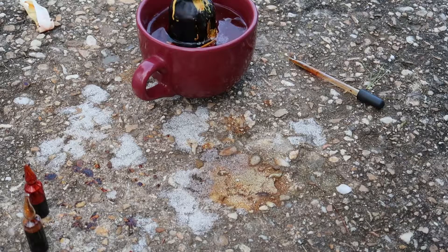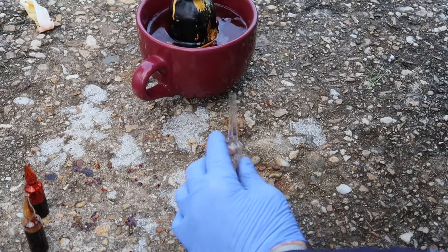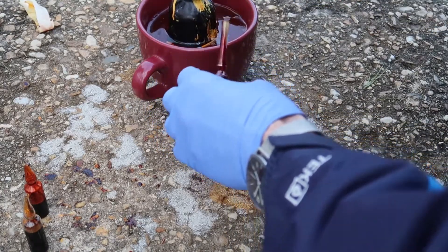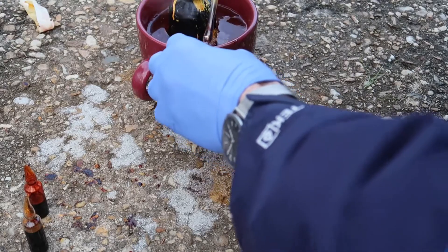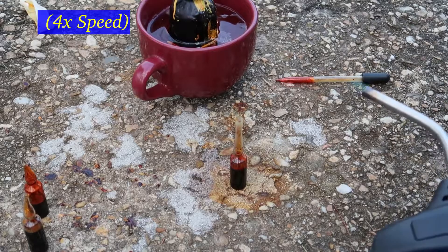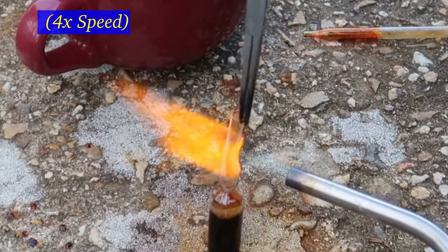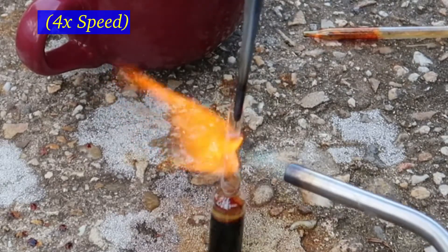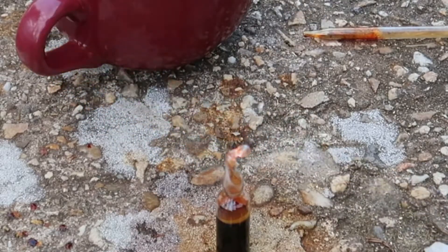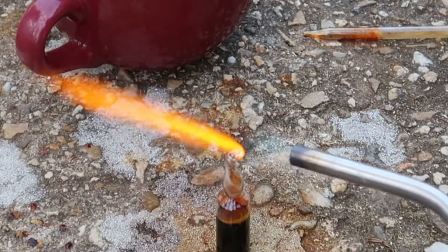Still more of this dastardly stuff to get rid of. Oh, this is scary. I set up a fan behind me to keep the air blowing in the right direction. That one's no good - a little bubble there. I guess we can melt that bubble down.